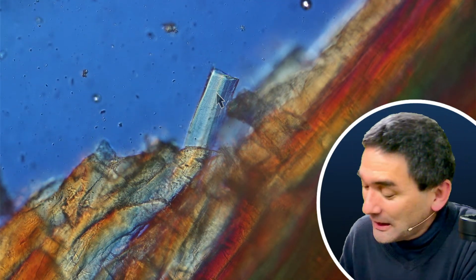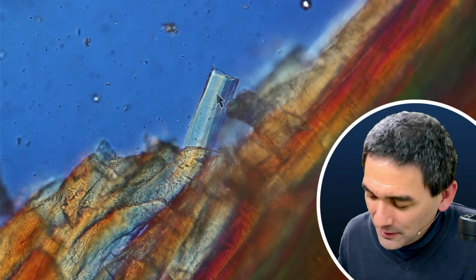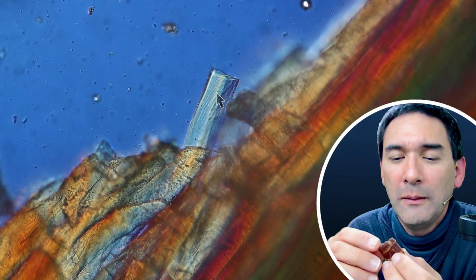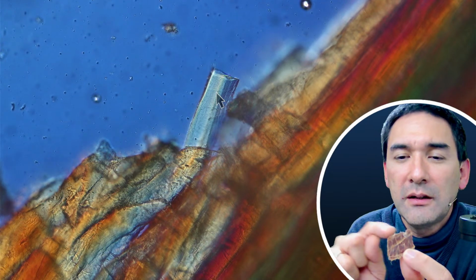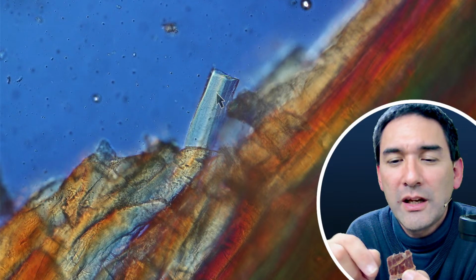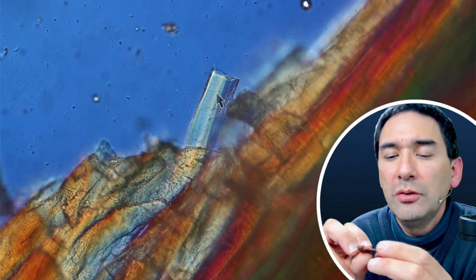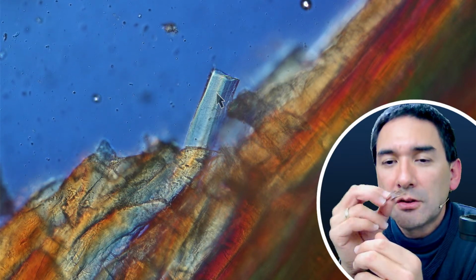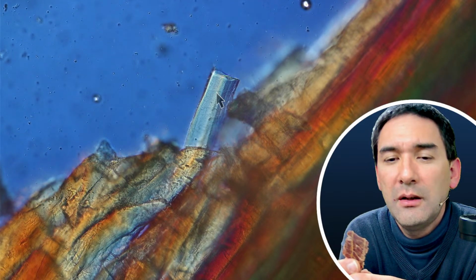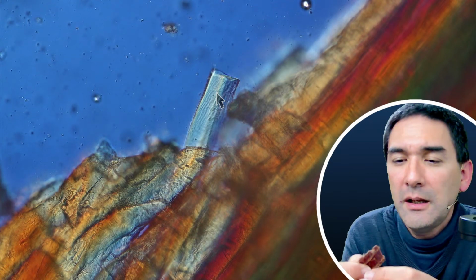Actually, I was thinking about cutting the meat under the microtome, but this is probably not going to work quite well. And if I were to cut it across like this, then I'm not able to see the striations, because they're running longitudinally. So what I'm going to do now with this piece here, it smells good. No, I'm not going to eat it. I think I'm going to soak it in water overnight, and maybe I'm able to prepare a somewhat nicer slide.